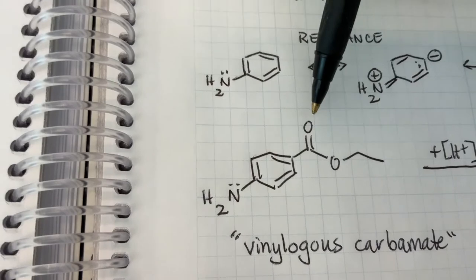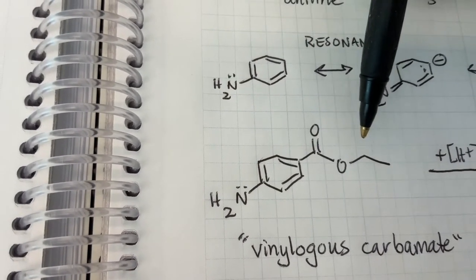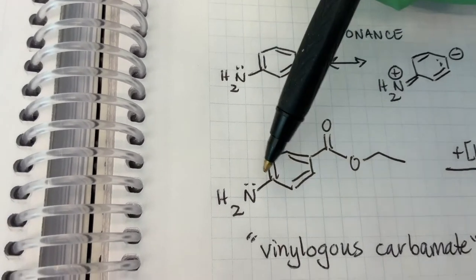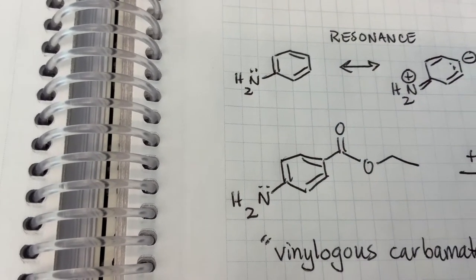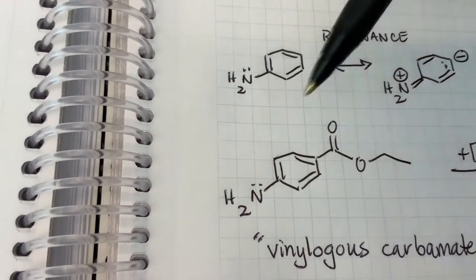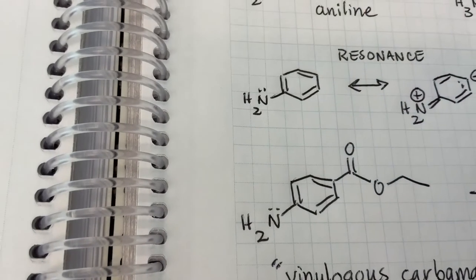Anyhow, the IUPAC name could also be named as the ethyl ester. So ethyl para-aminobenzoate. Because we name esters like we do the conjugate bases of the carboxylate salts. So this is a benzoate ester. It's the ethyl ester of para-aminobenzoic acid.